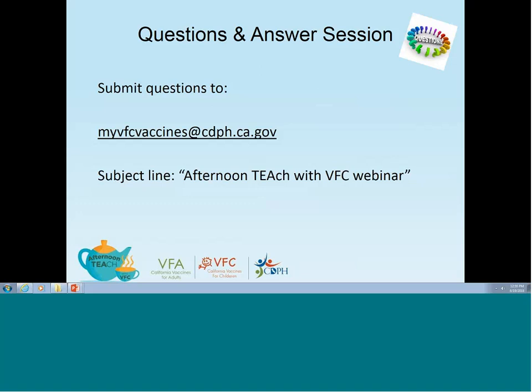So what I've been doing is we do have to plug the AC adapter in to get the readings, and that is the only time that it occurs. We have the static suppressors in place to try to help prevent that. There's no other electrical devices that are being used in that room. We've actually replaced the data logger a couple times, and it's still the same thing.